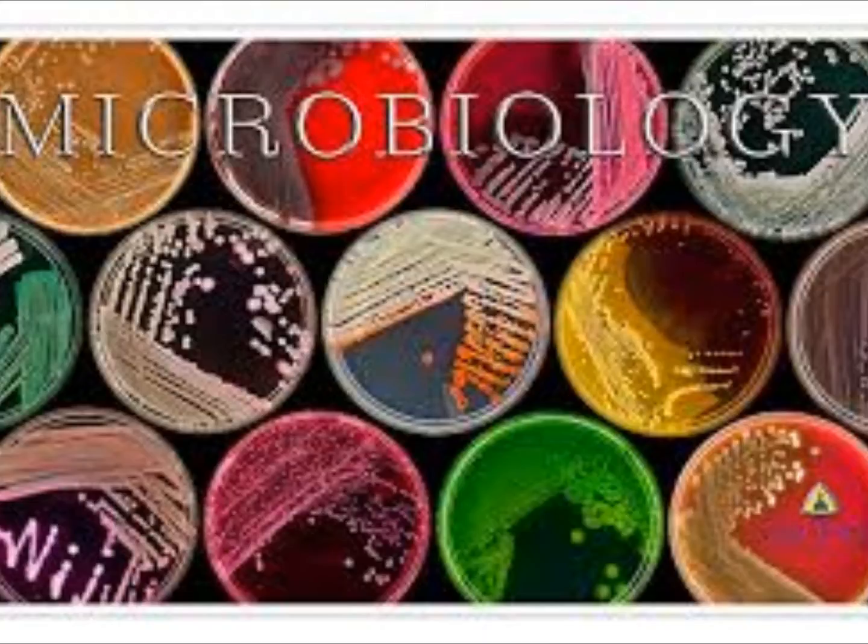Do you have to re-grab each time you put in the water? We're doing 3 slides or not? Nope. You should be able to only pick up one colony and emulsify it. Everybody should have 1 gram stain from your blood plate. You are only doing one slide from the blood plate, that's it. We're not doing the MAC and the CNA, only the blood plate. So you should only have one slide labeled.